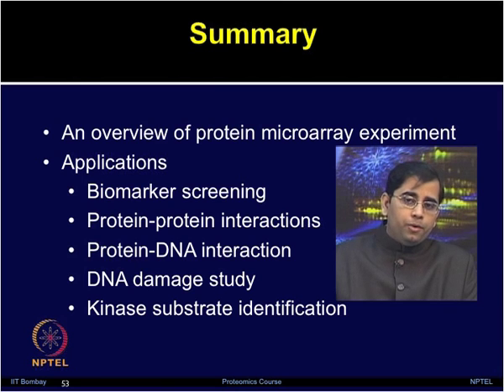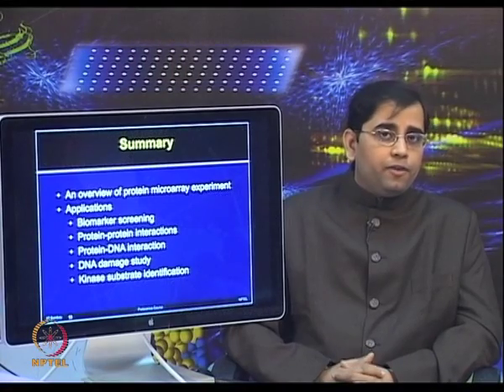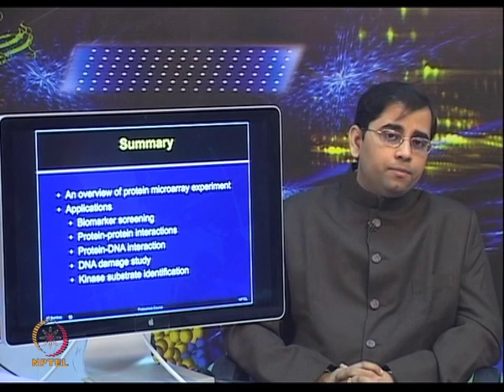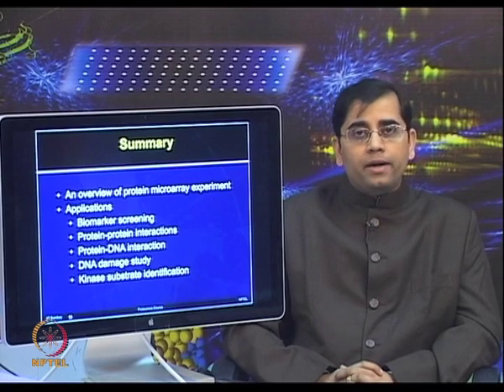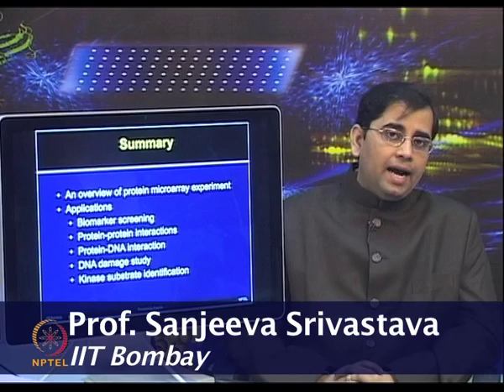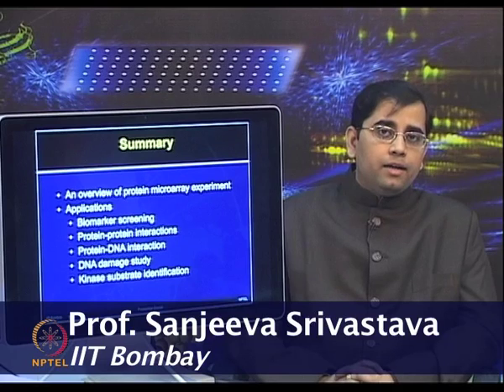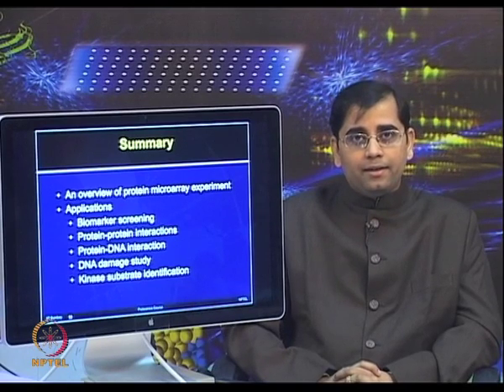So, in summary, today we talked about an overview of protein microarray experiments. I refreshed you about the different types of protein microarray platforms which we discussed in the previous lecture, and then we talked about different types of applications including biomarker discovery, protein-protein interactions, protein-DNA interactions, DNA damage study, kinase substrate identification, etc. We will continue our discussion in the following lecture on microarray data analysis and challenges associated with these types of high throughput data. Thank you.